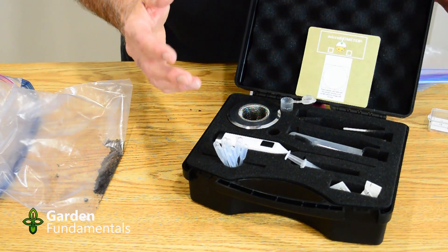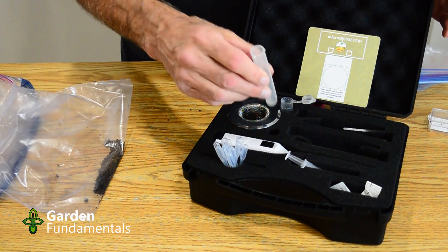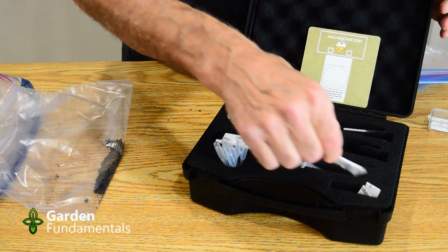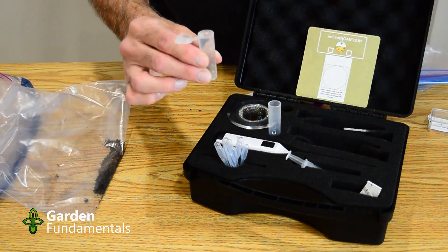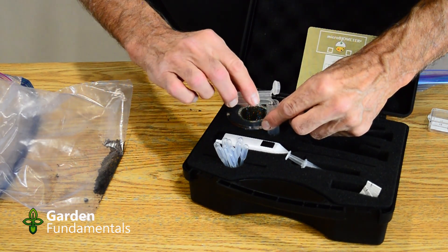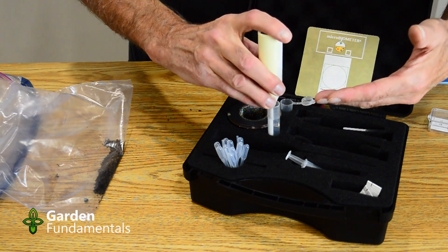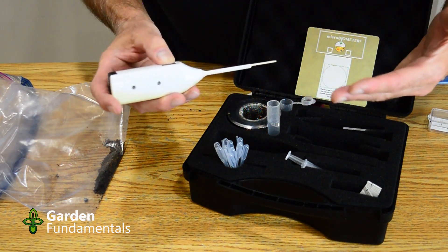The next thing to do is get your test tube ready for the soil sample. The kit comes with nice tubes and even a place to put them. Now we want to prepare some liquid that's going to be used to extract the microbes from the soil. To do that, take one of these pre-measured little packs, tear the top off, and empty it into the test tube. Then take the other tube, which is pre-measured for 10 milliliters, and pour it into the tube. It comes with a handy mixing stick that works just like an electric toothbrush, and you're going to use this to do the mixing. Mix it for about 10–15 seconds, just long enough to dissolve the salts you put in.